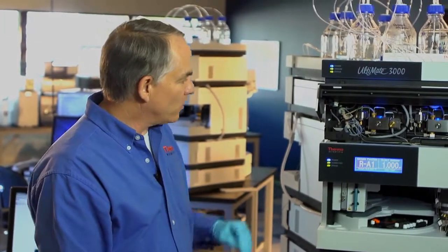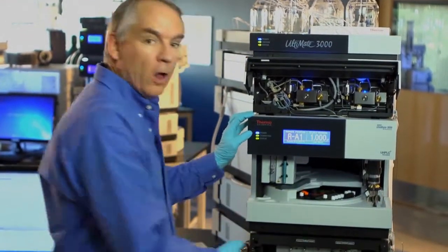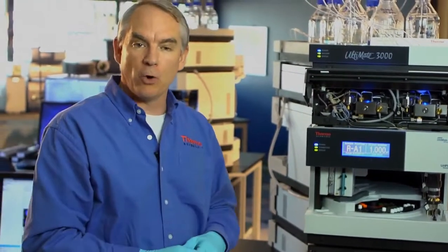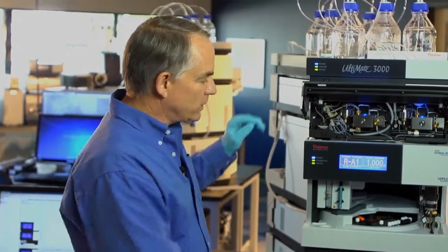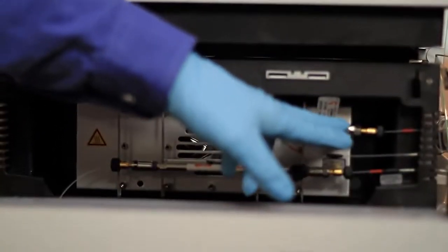What's going to happen now is that while the right pump is pumping through the analytical column and completing the prior separation, the left pump is going to take the sample that's drawn up by the auto sampler, load that onto the solid phase extraction column and for a couple of minutes it's going to pump to remove the matrix including sugars, alcohol, oligosaccharides, proteins, any of the sample matrix components that we really want to get away from the separation system where they might complicate the chromatogram and eventually foul the analytical column.